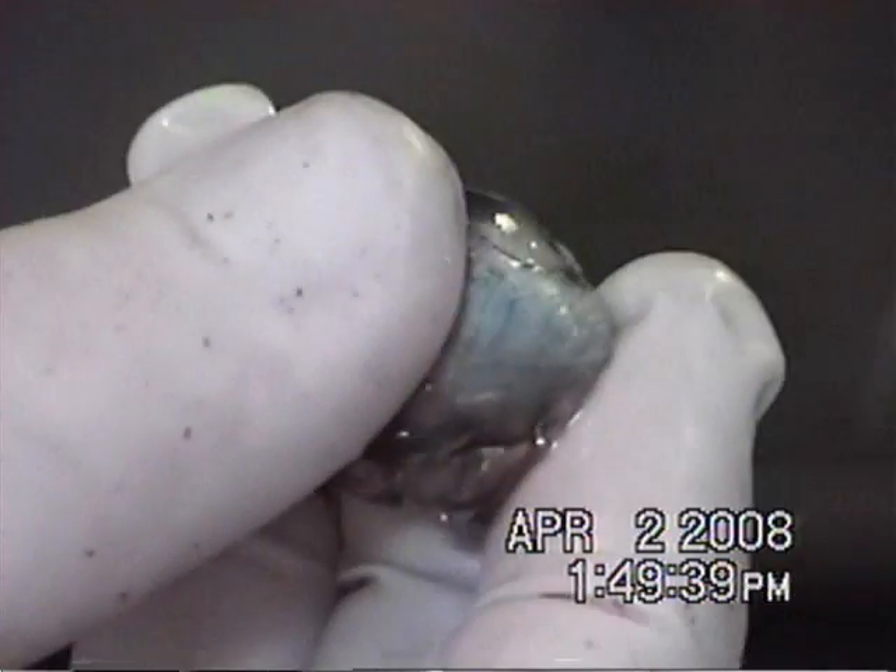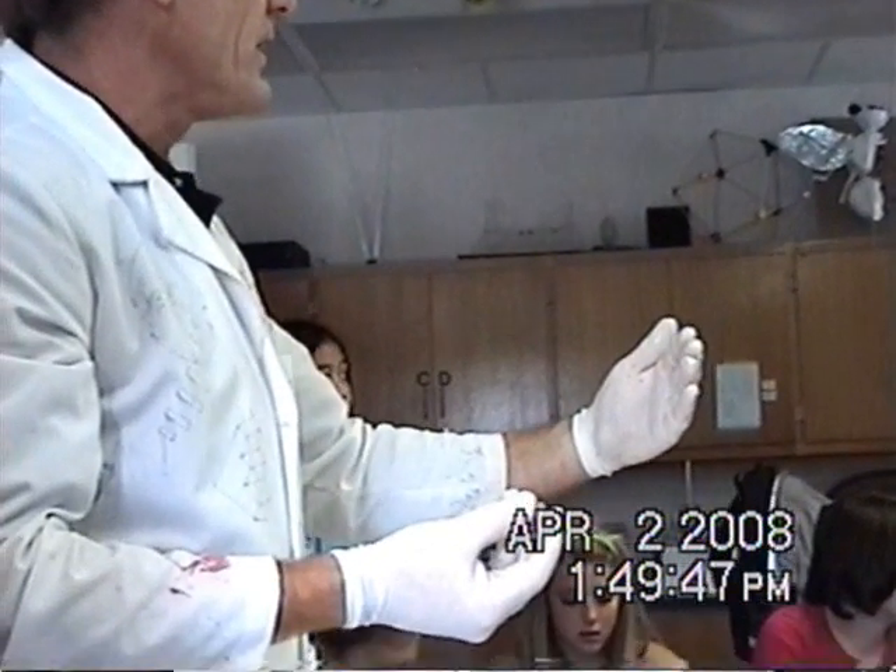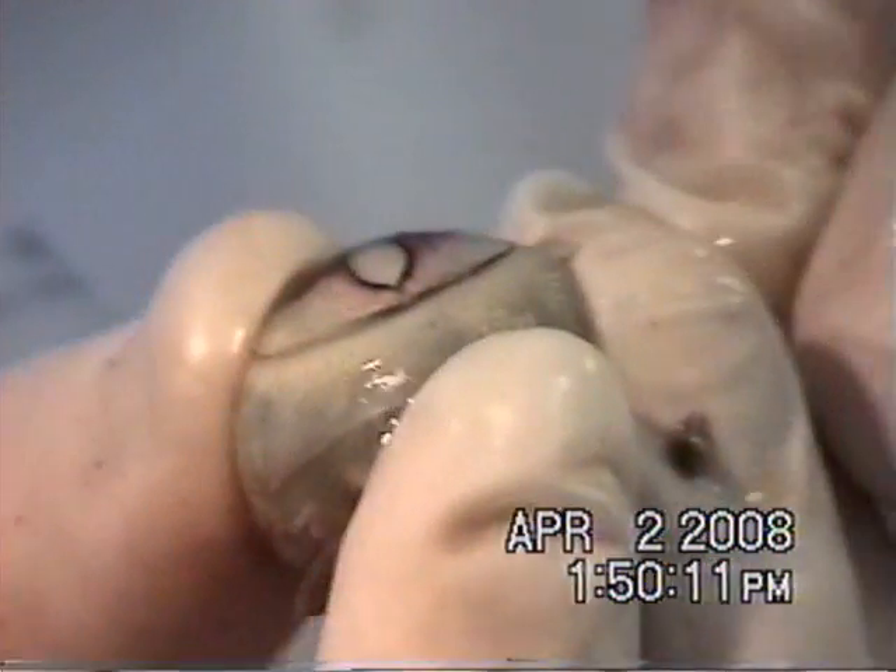What you are seeing — this clear material on the outside is actually the cornea. So it has a clear covering and then the lens is on the inside. It's kind of solidified. It's dead, it's broken.